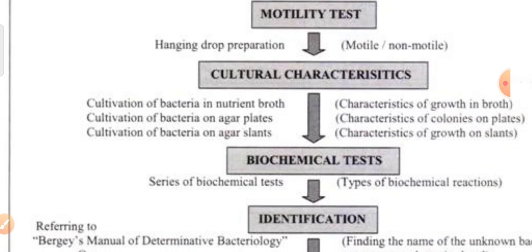Nowadays, motility test can also be performed using motility agar. You prepare the semi-solid medium, fill it in a test tube after sterilization, and using a straight wire inoculate into the center of the medium. It is not a solid medium — it contains less agar, so it is a kind of semi-solid gel. If you see growth only along the straight line, it is non-motile. If the growth spreads like a tree or like a root, then it is a motile organism.